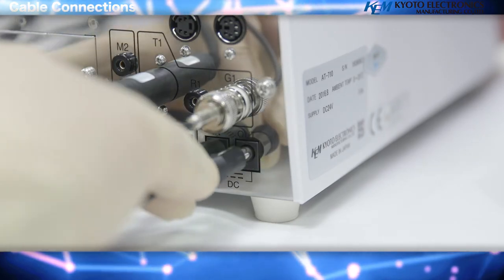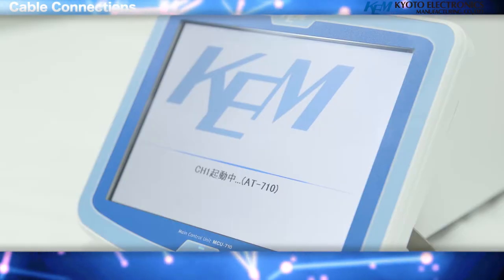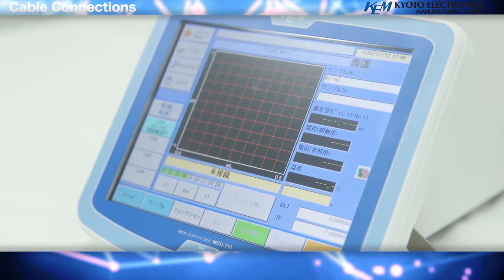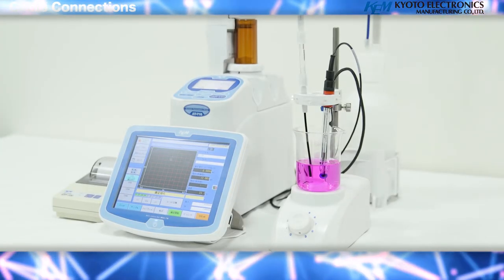You can also connect a USB printer, a keyboard for inputting characters, a barcode reader for setting method, and a foot switch that can start measurements without the need to touch the device. By connecting a personal computer, it is possible to control the unit and have data communication via the attached PC.